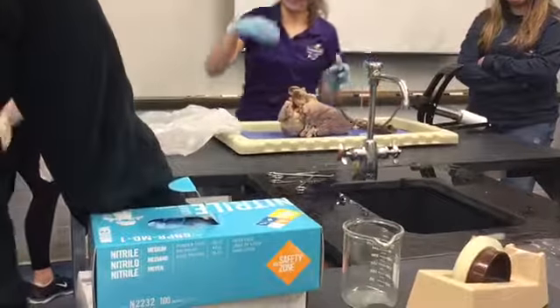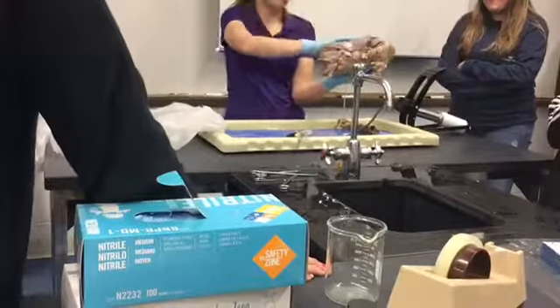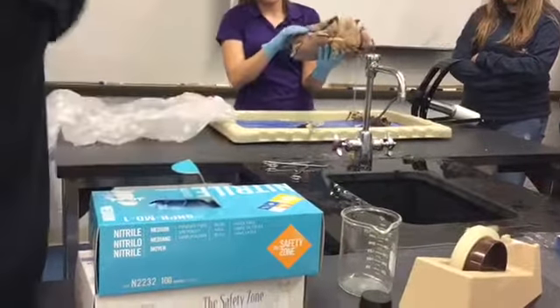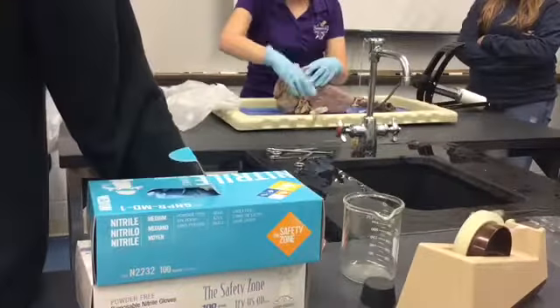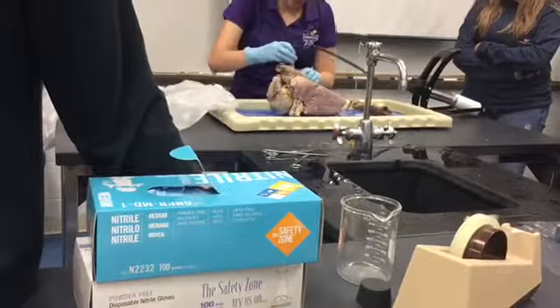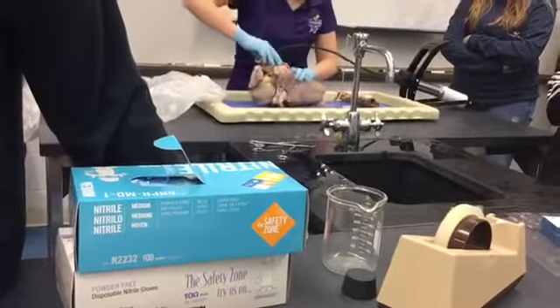Yes, a while ago, as in 2014. This has been cut, so I can't inflate all of this during the butchering process. It was cut. But I can try to inflate part of this lung. I won't be able to get all of it, but I'll get part of the left lung when I feed my little contraption down in here.